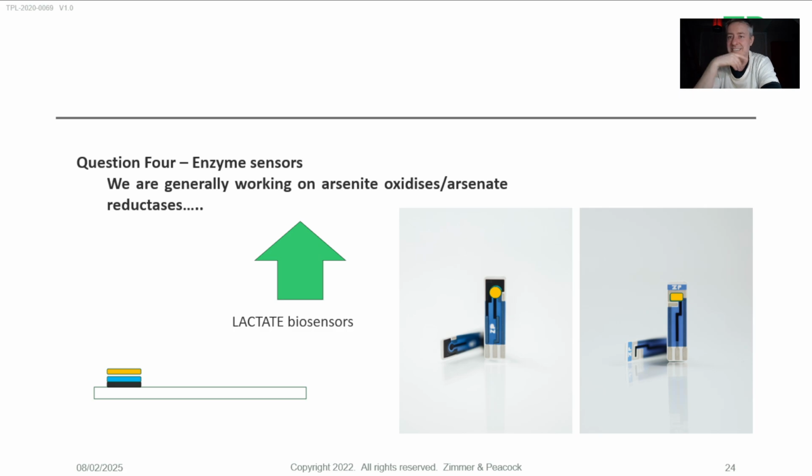Many potentiostats these days are actually becoming lower power. If your potentiostat is plugged into the mains, then you probably worry less about something called the compliance voltage. And then look up barrier layers. I do think that you can make a rubbish enzyme look better if you put what's called a barrier layer.